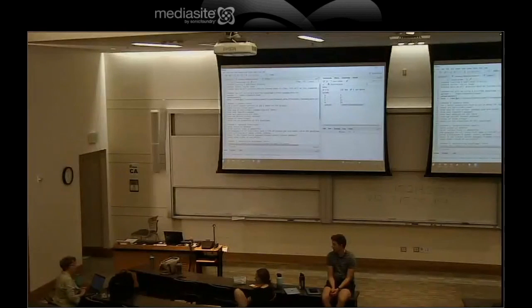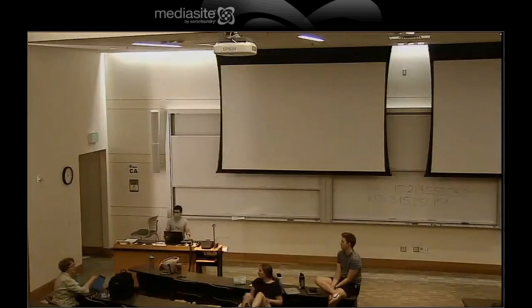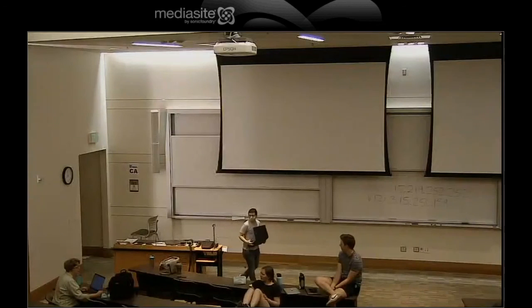Try an R script? On Friday? Sure. You have that R script that you had in the hub? I did that for way more people than you realize. I believe it. That's one that you should just run locally. I just wanted to see how to turn it into the rank file. It's just like one line. That's what generates the rank file. They're screwed up, because they don't know how to turn it into a rank file.